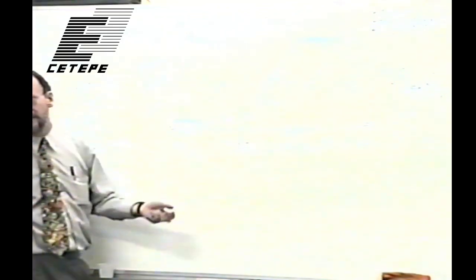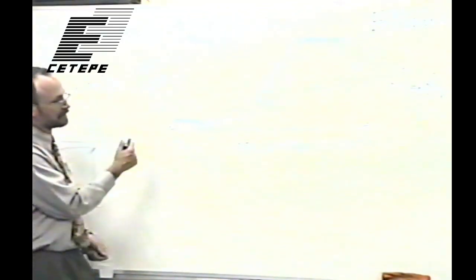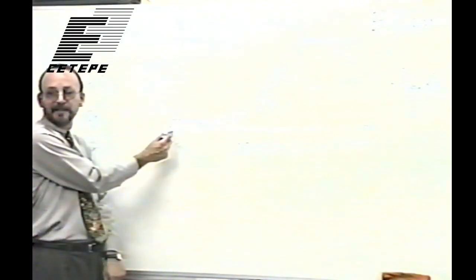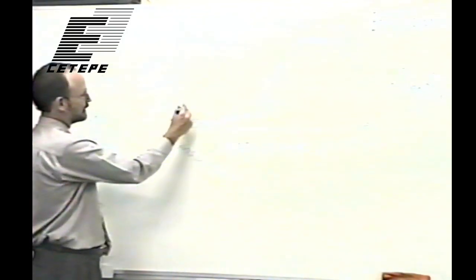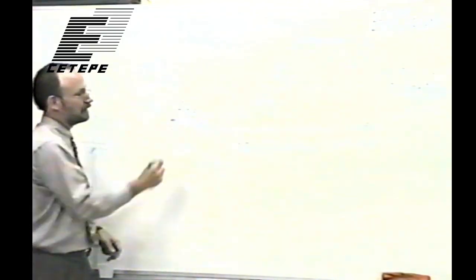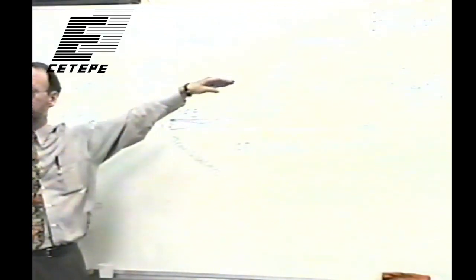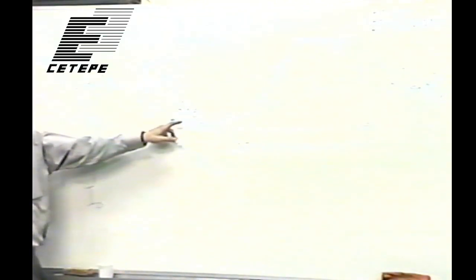So there's a few other things about film. The most important one I want to point out is the fact that these curves are never at zero. This level right here is called fog. And this, along with the nonlinearity of this whole relationship, is really the bad part about film, especially for scientific purposes, because this fog here is noise.